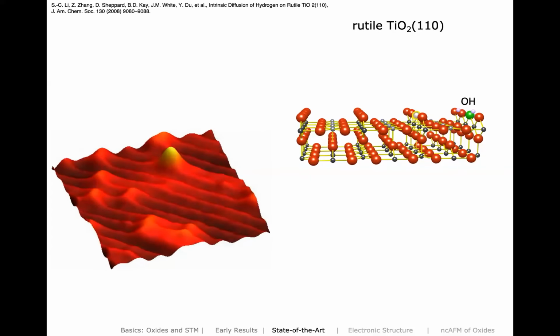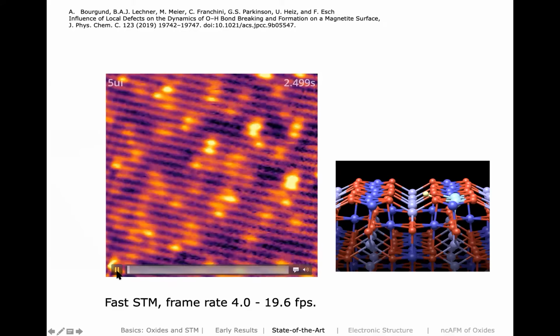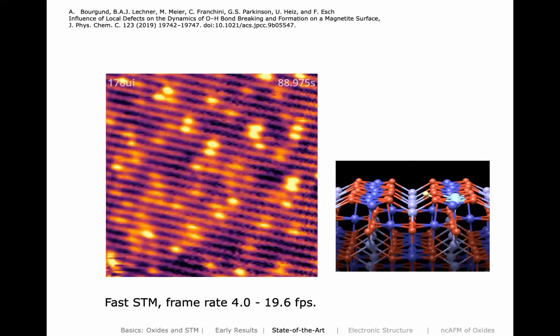Now, if I say state of the art, this is a really state-of-the-art movie on an oxide surface, a different one now. This is a magnetite surface by the people in Munich, Barbara Lechner and friends. Here again you have these rows, here iron rows. You have a hydroxyl. The hydroxyl changes the density of states and makes a bright spot. And then this hydroxyl hops back and forth in between. So here you can see that this is flickering, because these OH groups go back and forth. I'm showing you this because it is a state-of-the-art video, up to 20 frames per second. So you can really measure these dynamic processes in real time now. That's what one can do today.